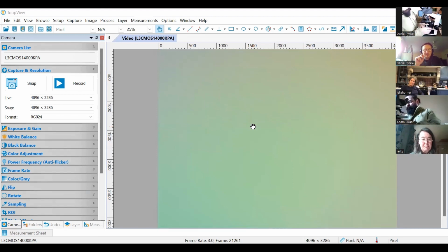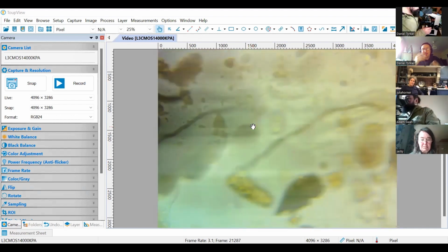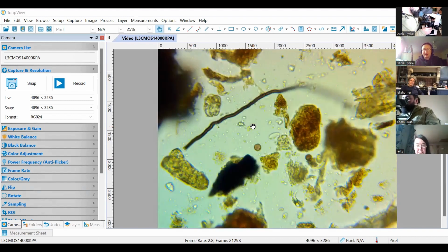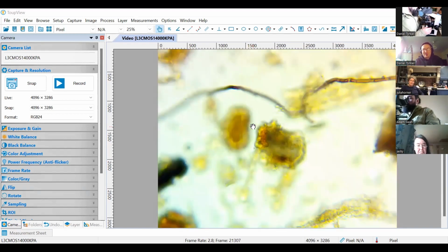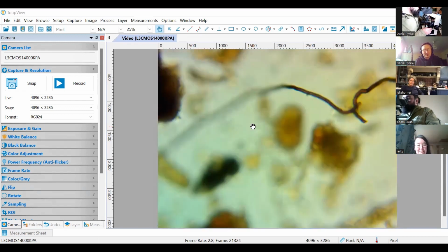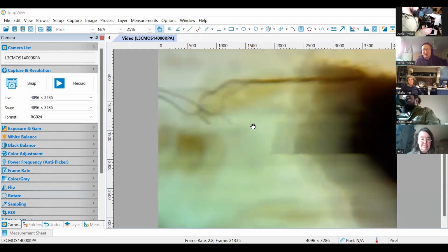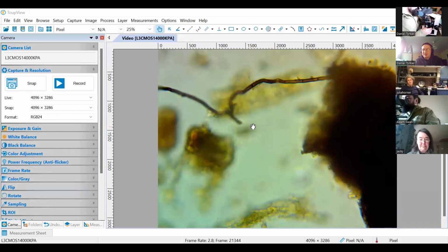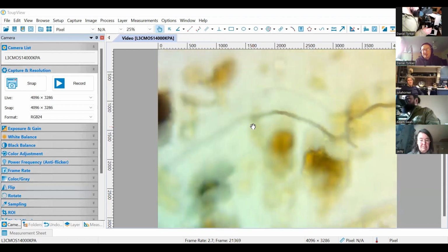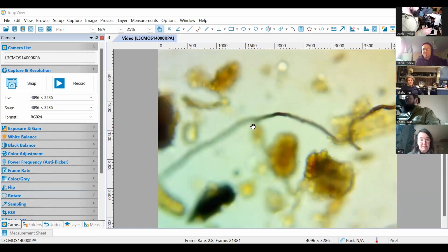There have been situations where some people were really happy to see fungi. And fungi can be quite challenging for people to grow out in compost. And so when people are happy to see fungi, they will often overestimate what they're seeing because they want to have more of it. We've had situations where somebody thought the fungal hyphae was 13 micron in diameter, but in fact it was closer to 4. So it's important to use something like this to have as much standardization between technicians as possible.